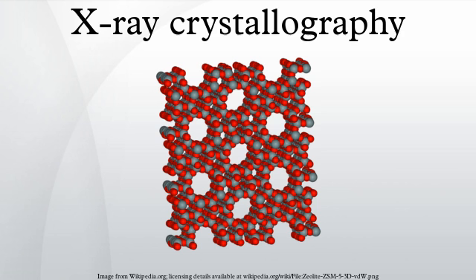Protein crystals are scooped up by a loop, then flash frozen with liquid nitrogen. This freezing reduces the radiation damage of the X-rays, as well as the noise in the Bragg peaks due to thermal motion. However, untreated protein crystals often crack if flash frozen. Therefore, they are generally pre-soaked in a cryoprotectant solution before freezing. Unfortunately, this pre-soak may itself cause the crystal to crack, ruining it for crystallography. Generally, successful cryo conditions are identified by trial and error.